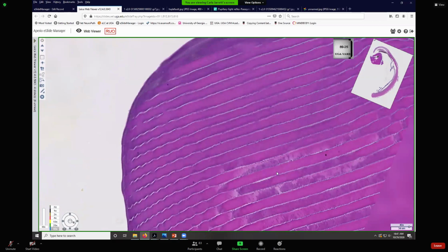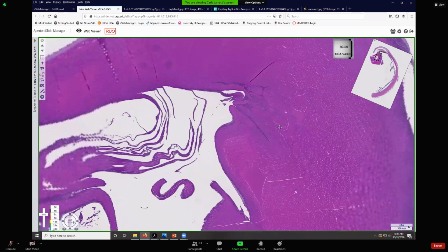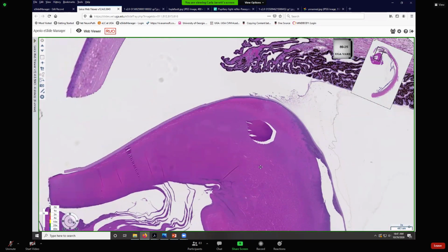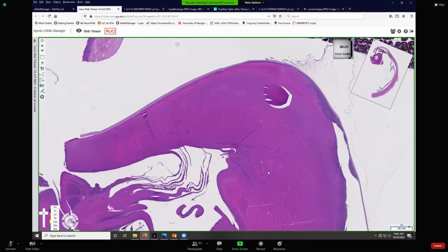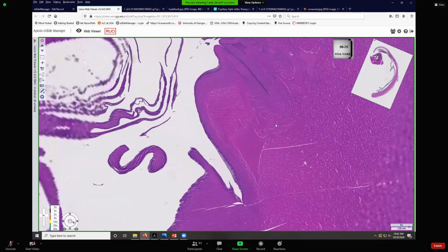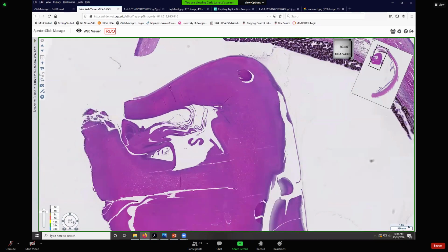So they're not really living, after a fashion, kind of like the keratinocytes of the stratified squamous epithelium. That stratum corneum is dead cells. These lens fibers are pretty much dead cells after they get rid of all their organelles. Not entirely dead, kind of like a red blood cell that kicks out all its organelles and its nucleus. It's still sort of living, like a zombie. How about that? Lenses can be zombies. It's a good Halloween thing.